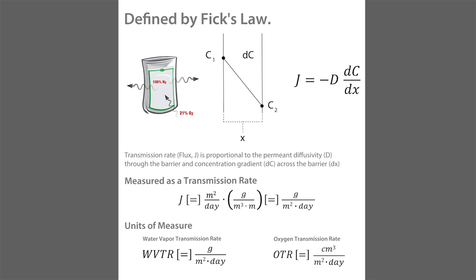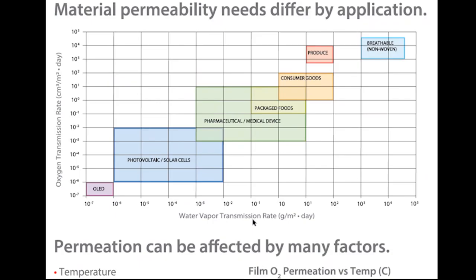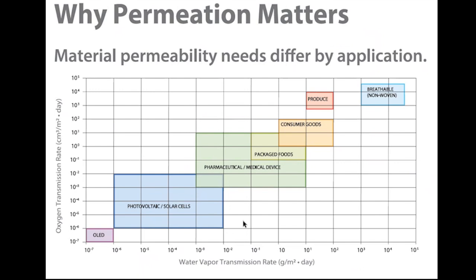So a little difference here. When we look at oxygen, CO2, we're focusing on volume of gas in the material. Here we've normalized it to the weight of the water over time. The next slide we're going to focus on too is really like, why does it matter?